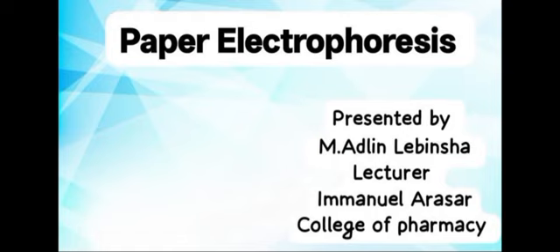Today we see about electrophoresis. First we see the introduction to electrophoresis. Electrophoresis means movement of charged particles. The correct definition is: electrophoresis is the movement of charged particles towards the oppositely charged electrodes under the influence of electric current. That is called electrophoresis.